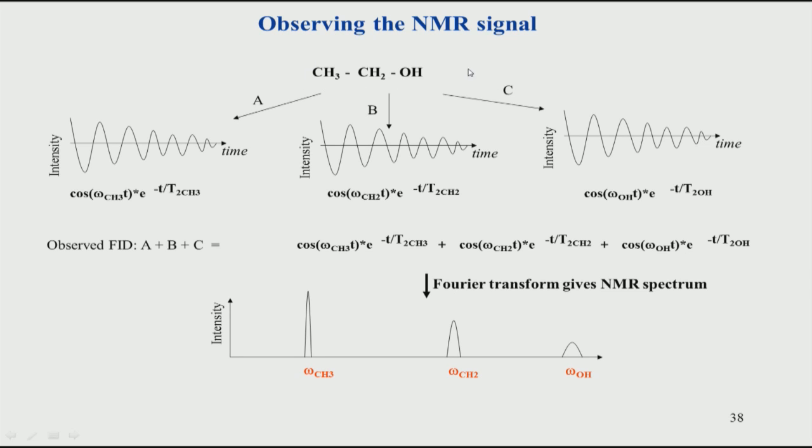The area of the peak of methanol, which is also in the same sample, will be proportional to its concentration. Therefore, by directly comparing the peak areas in NMR, we can find out the concentration, of course provided we have a reference concentration, which we will see later.